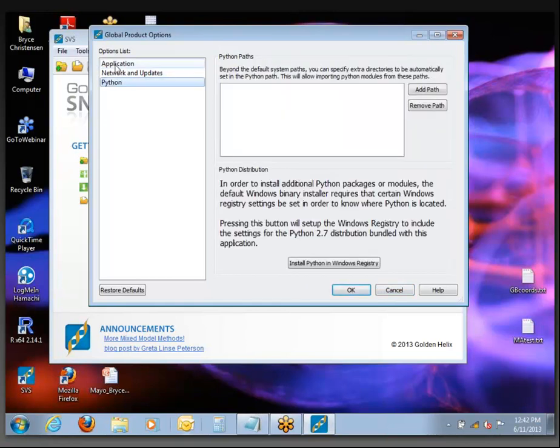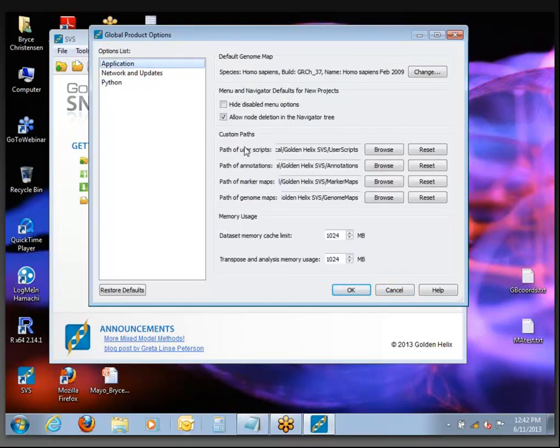There are other options here. If you are working in a lab where there are a number of people all using the software and you want to share a single database for annotations or for collecting any custom scripts you might write, you can change the default location where annotations and other bits of data are saved. Ninety percent of the time, you'll just want to leave these exactly how they are if you're working alone or with limited collaboration.